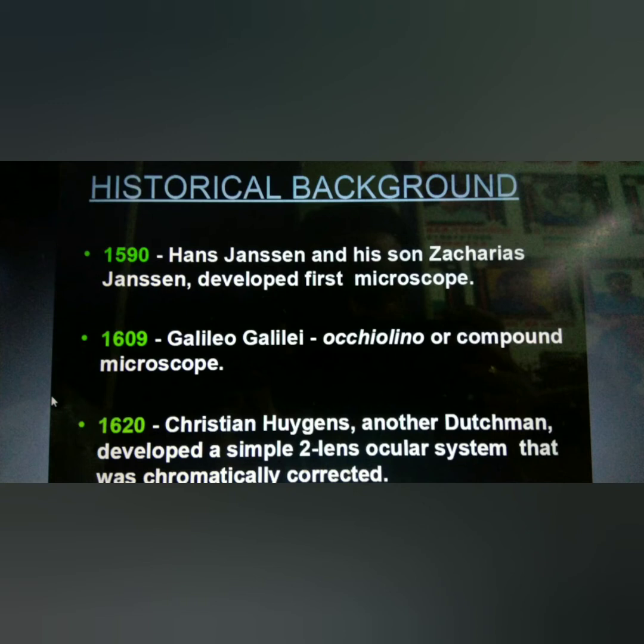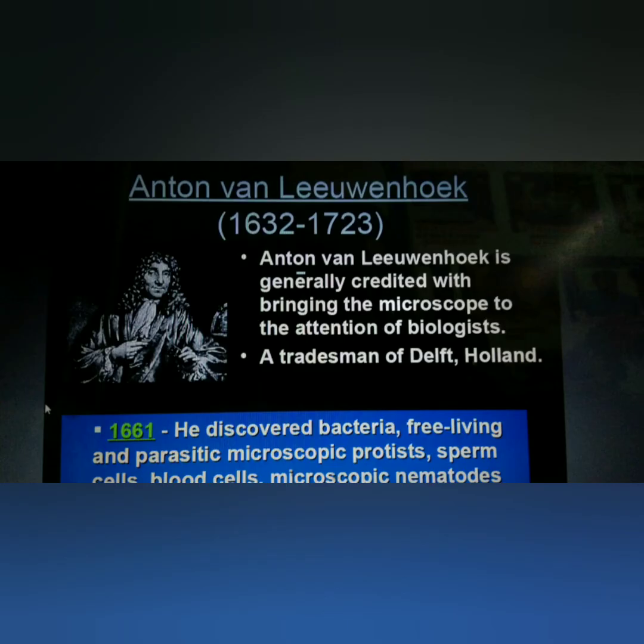Next. Now, without historical background, one cannot understand it properly. It has been observed that many scientists, before the 18th century, tried to make various kinds of microscope of their own. Galileo Galilei also invented some microscope. Christian Huygens, a Dutchman, invented a microscope, and Hans Janssen also.